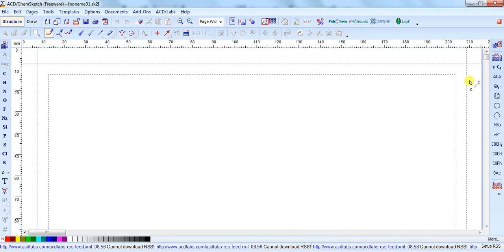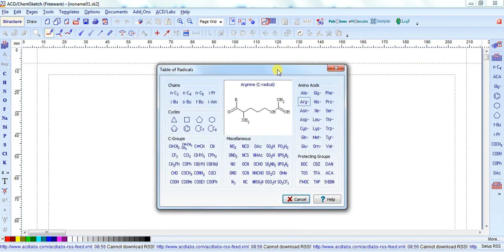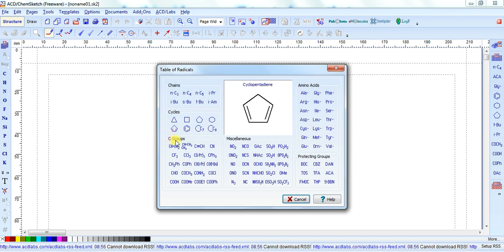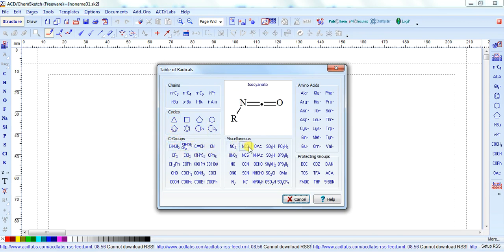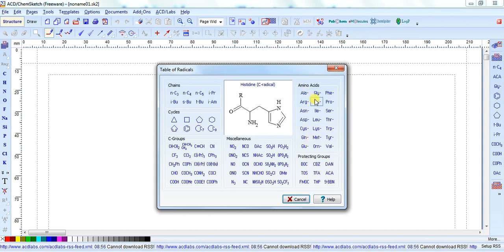Here on the left-hand side there is also an icon; when you click on it, it gives you a table of different elements like chain radicals, cycles, C-group elements or radicals, miscellaneous, protecting groups of radicals, and amino acids. Whatever you want to use, you can find them here.